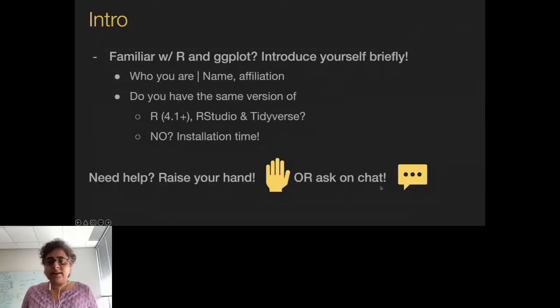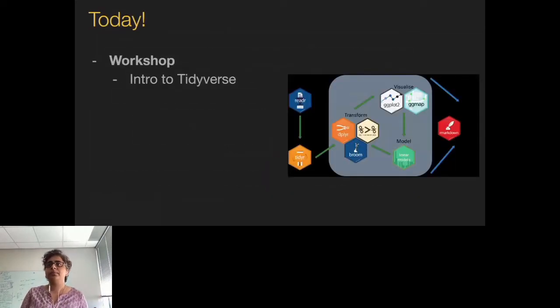Okay. So the raise your hand, I don't know about the raise your hand thing now because it's not Zoom anymore, but I would still say ask your question on chat or Slack or whatever it is. Batul is going to monitor it. Stickies, I will monitor it myself because I have it open on another screen. Okay. I hope you have RStudio and Tidyverse installed. Otherwise, please install it in the background.